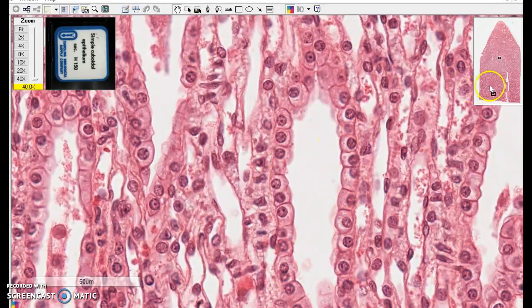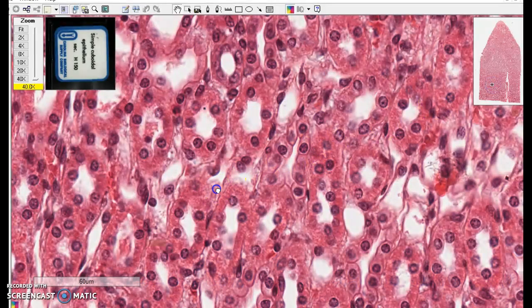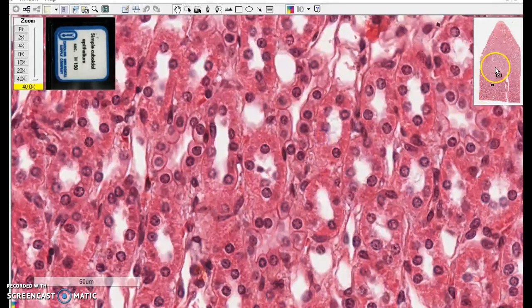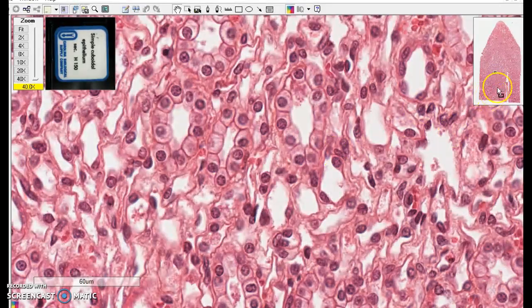Let me go to a different place and we can see what I think of as the donut configuration in these. Let's try it here.